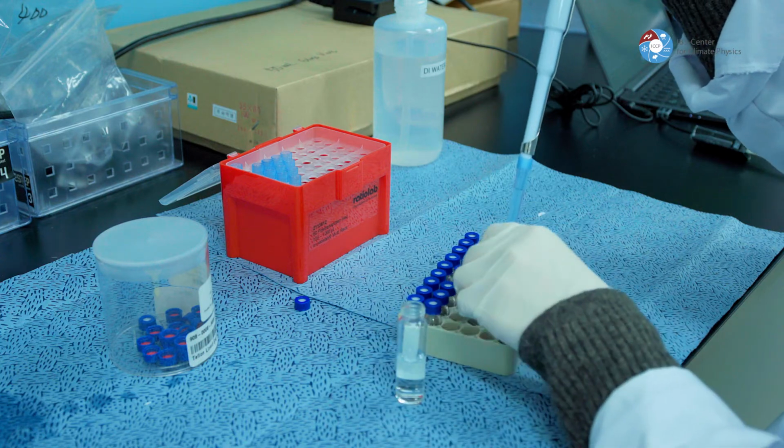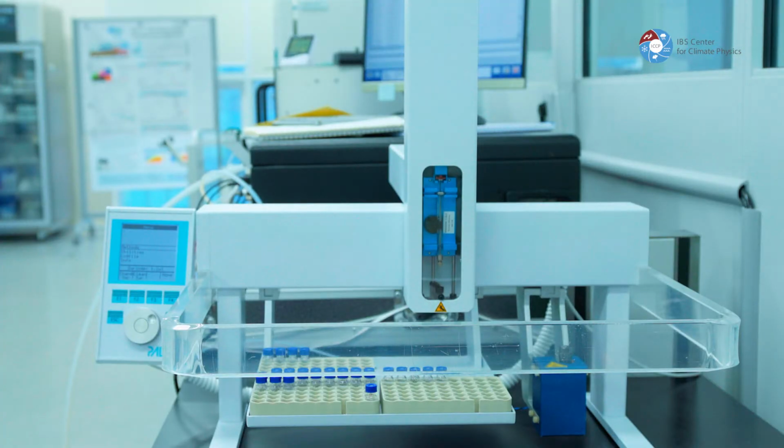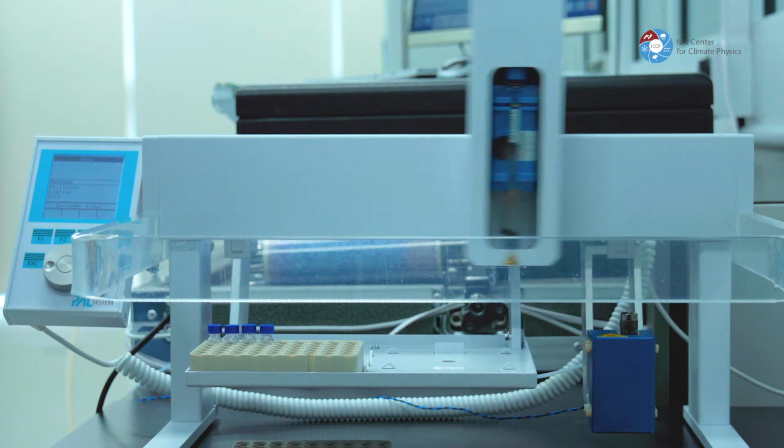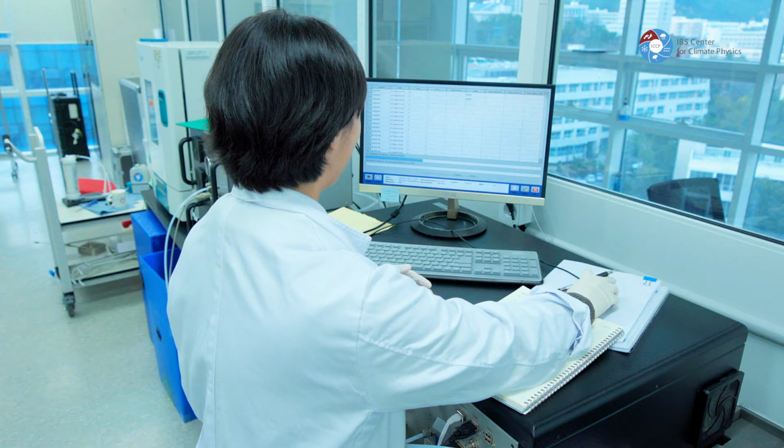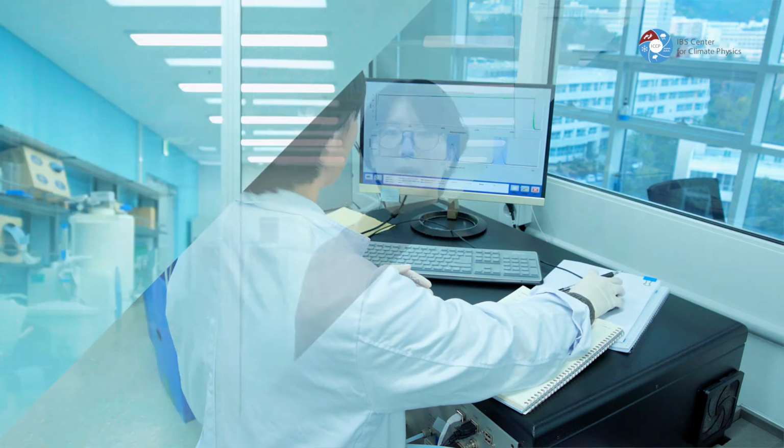While the method works extremely well for freshwater samples, it is still challenging to conduct high-quality measurements for seawater due to salt contamination in the vaporizing processes. I am now developing a new method for salt water, which is based on membrane filter and water vapor standard source units. In the end, my method will be significantly faster and even portable on icebreakers as compared to the standard isotope ratio mass spectrometry method used previously.